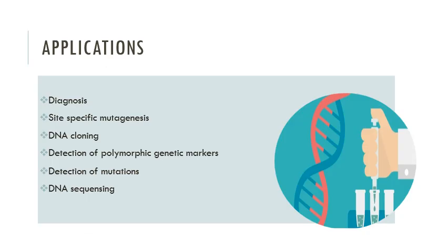Why or when do I use PCR? Sometimes you need to diagnose some genetic diseases or disorders, like the fragile X example we have, sickle cell anemia, or any other molecular-level diseases. You will just need to conduct a PCR and then a gel electrophoresis to visualize the products.